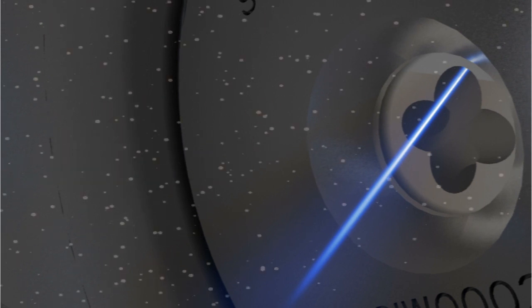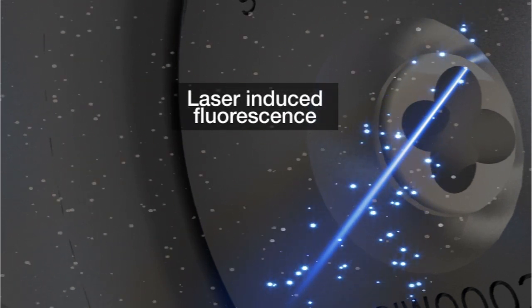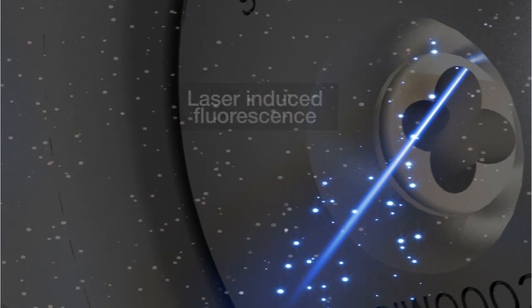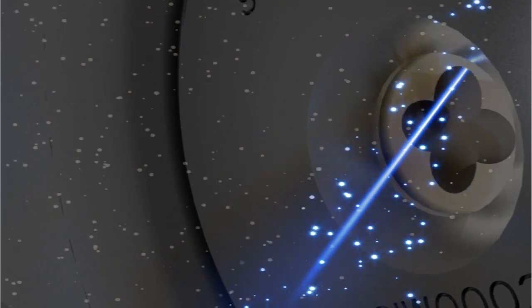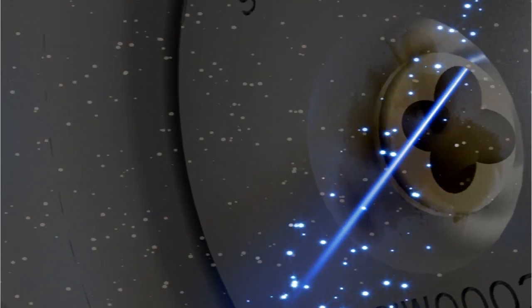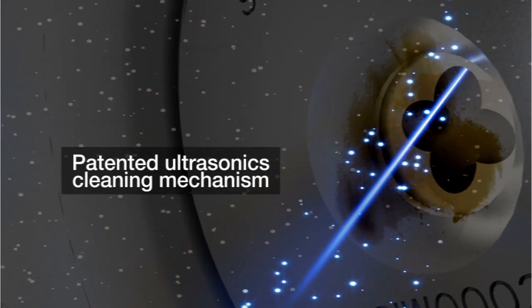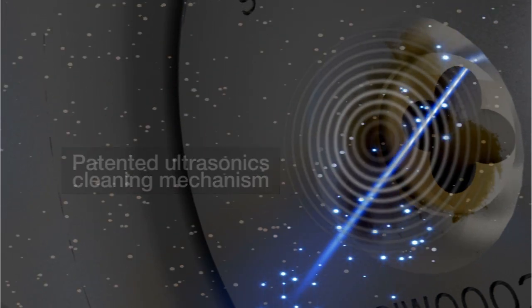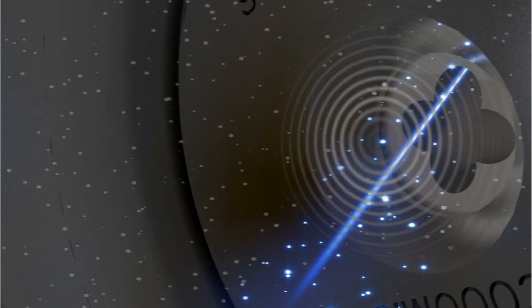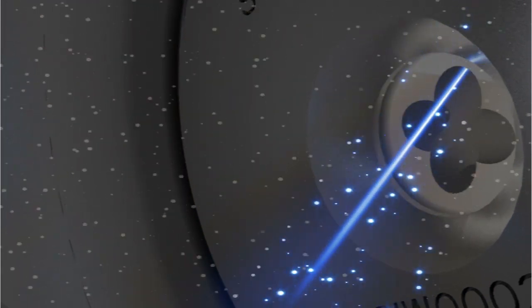During the measurement cycle, a laser directed into the chamber excites the oil and the fluorescence induced is measured. Periodically, at user configurable intervals, the patented ultrasonic cleaning mechanism cleans the sensor's head of any oil or fouling.